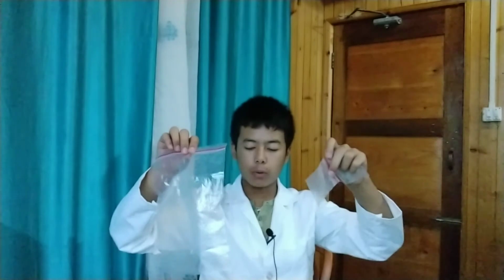I also use this kind of test tubes. I have a total of 6 test tubes with me. In the video on how saliva looks under the microscope, I took my saliva into the test tube, if you have watched. The next thing is some plastic bags just like this. When you go to forest sites, there are decaying leaves, decaying wood particles, some moss, lichens, so you can easily collect them in this kind of plastic bags.